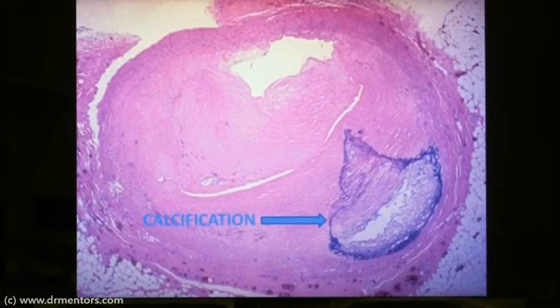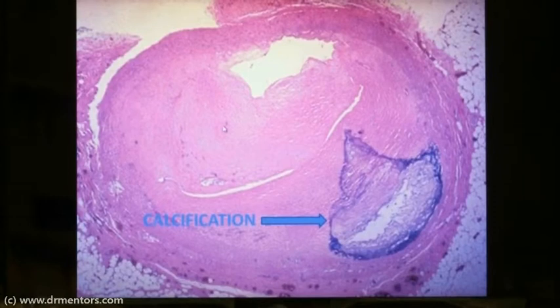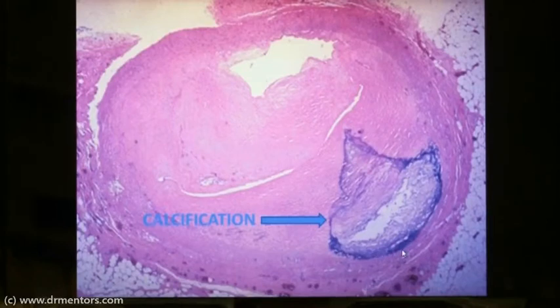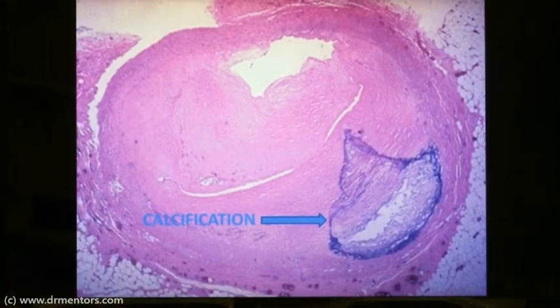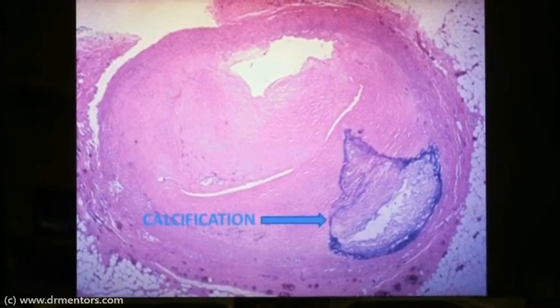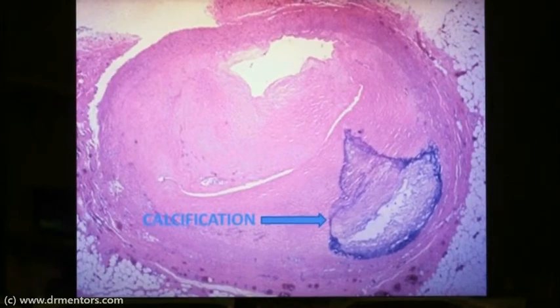Next we look at calcification. This is a cut cross-section of an artery, and over here you can see a blue patch of granular amorphous substance which is nothing but calcium. Calcification can be both dystrophic and metastatic. The most important example of dystrophic calcification is heart valves in rheumatic heart disease, where calcium deposits in dead and degenerated tissue. Metastatic calcification occurs when calcium levels are very high in the blood.